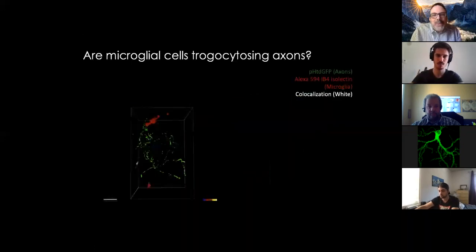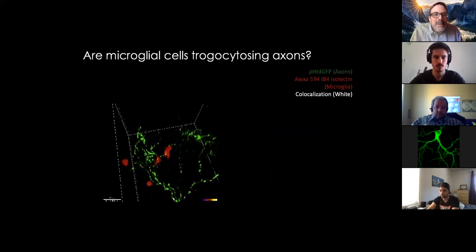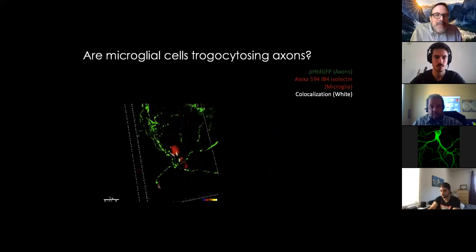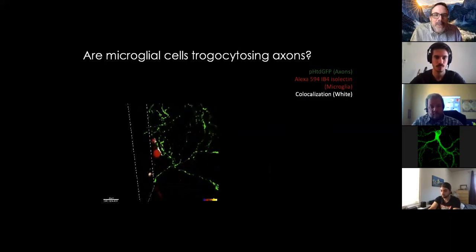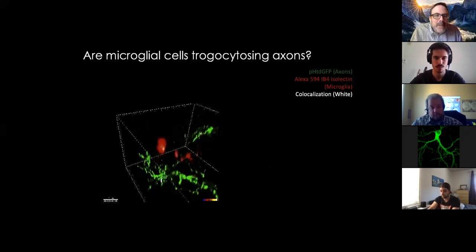We use the term trogocytosis, which refers to not eating entire cells, but just nibbling, like taking little bits and pieces off of the cell while it's still intact. And Tony Lim, a postdoc in the lab, was actually able to do these long, heroic imaging sessions where he captured the microglia in the act of trogocytosis. So here you can see the white represents colocalization of GFP and the red dye, the Alexa 594.